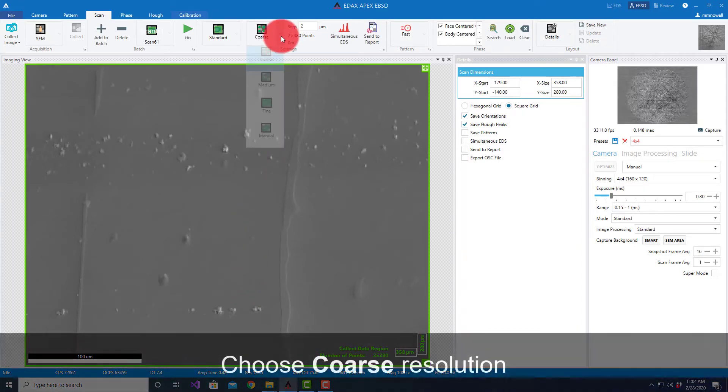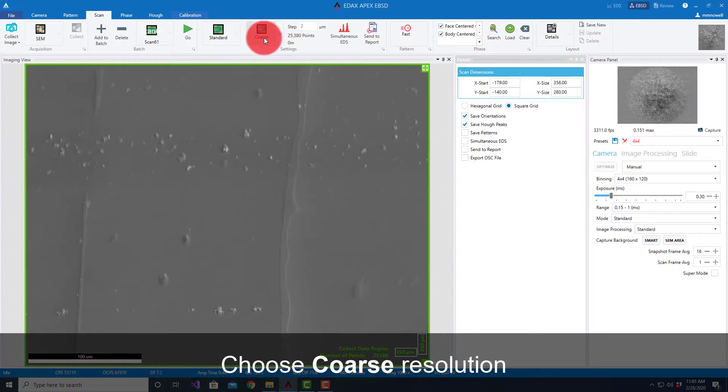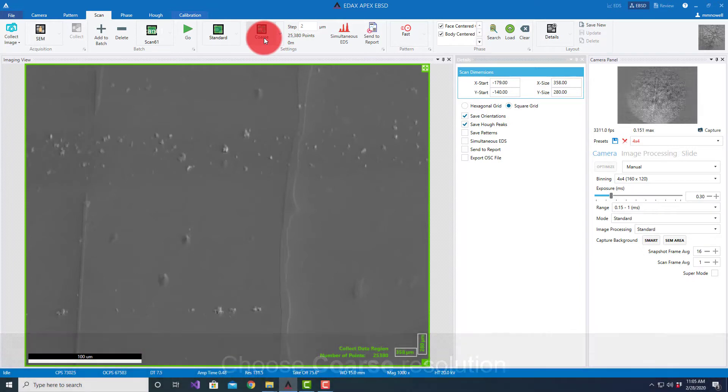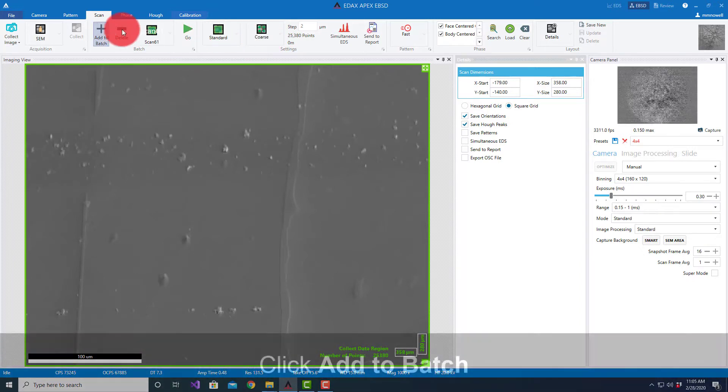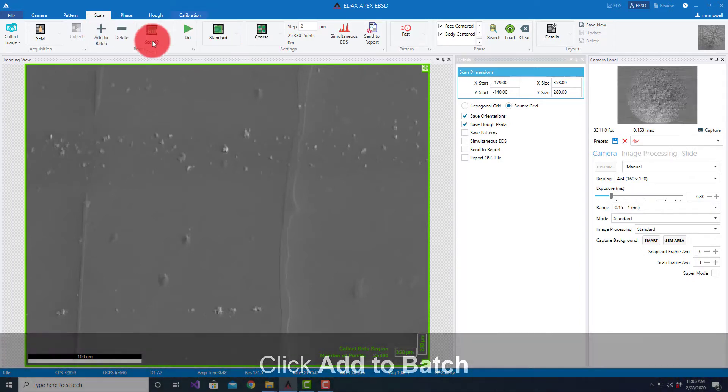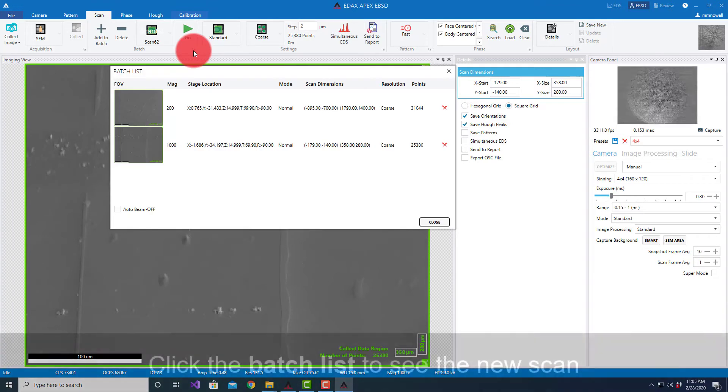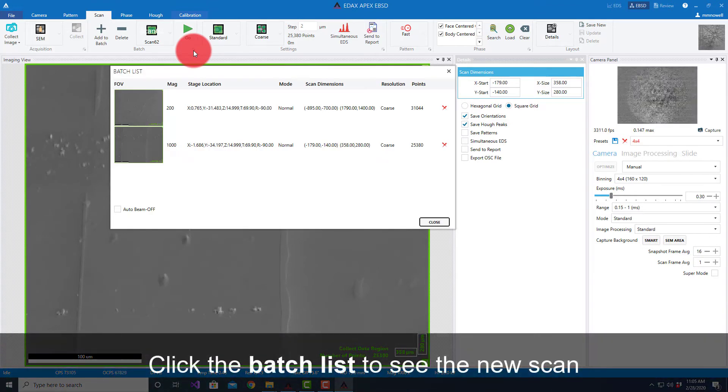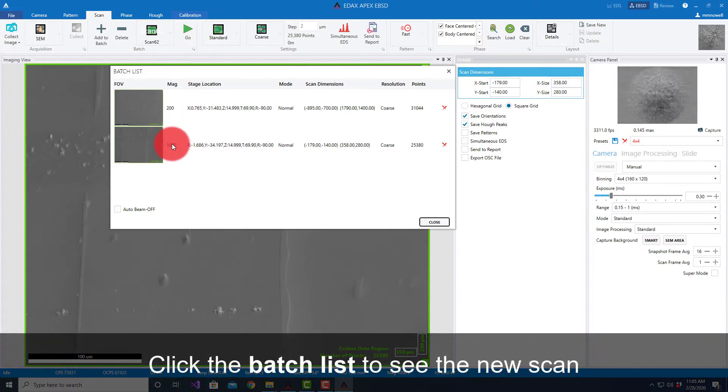I could select a different resolution. I'm going to keep coarse just so we can see the series of datasets quickly. Hit Add to Batch. If I look at my batch list, you'll see it's a little bit larger and my magnification has changed.